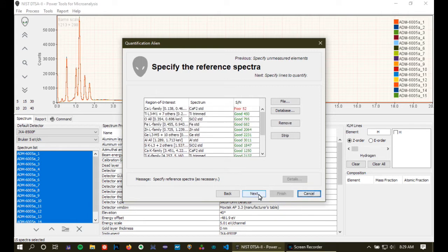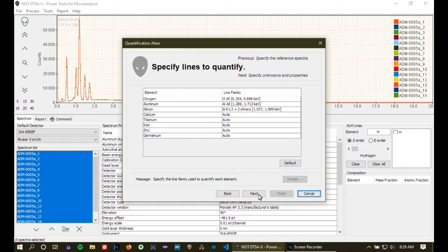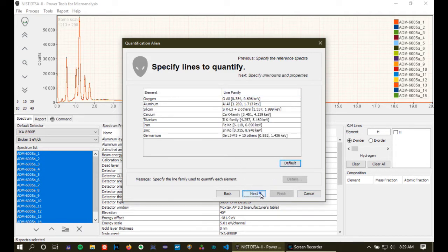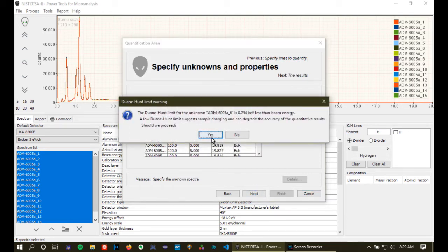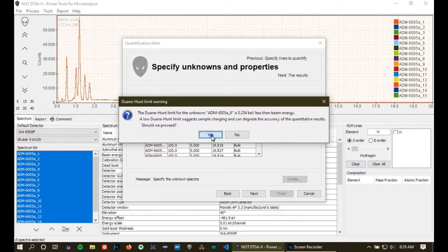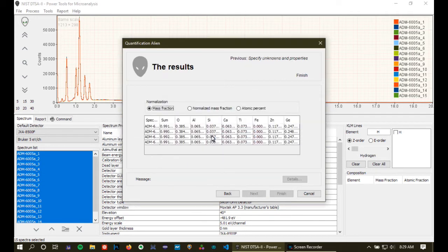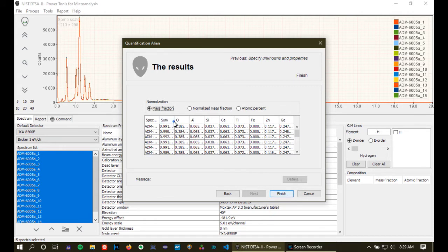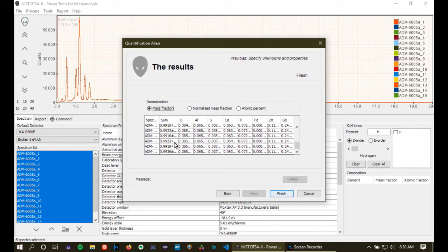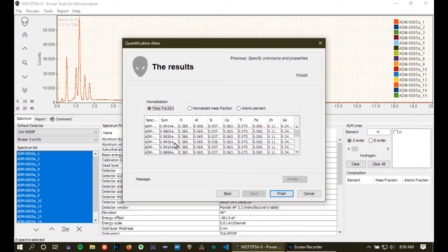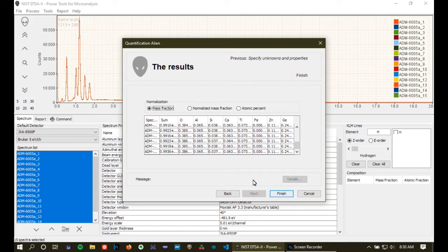So we're going to carry on and just select the default here, continue on and one of them it says is slightly low on the Duane Hunt limit. I'm not too concerned about that. Anyway, when we see, we see that this all works out very nicely. We have analytical totals in the 99% range. That's good.